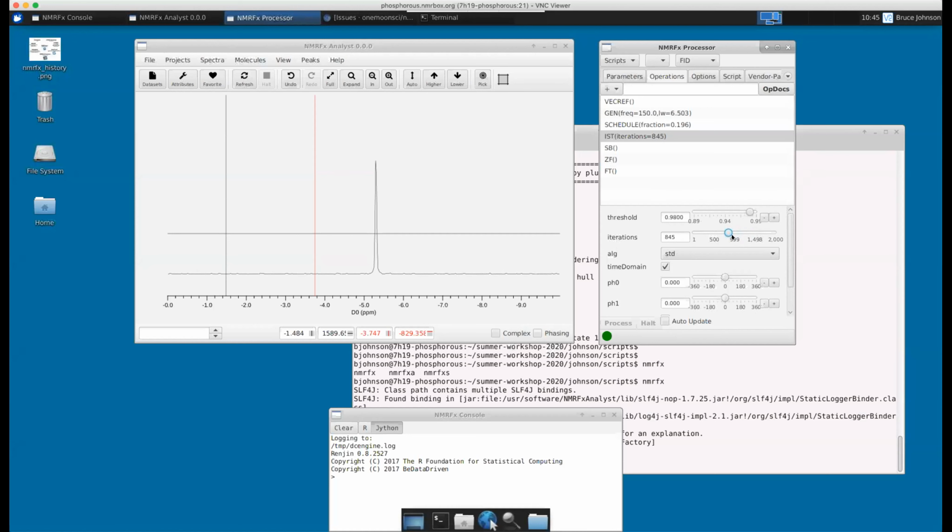In our implementation of IST, we don't have a stop detection method that says you've gone far enough. If you say do 1,000 iterations, it does 1,000 iterations. It would be faster if it detected when to stop, and certainly in this simulation, you could get worse.